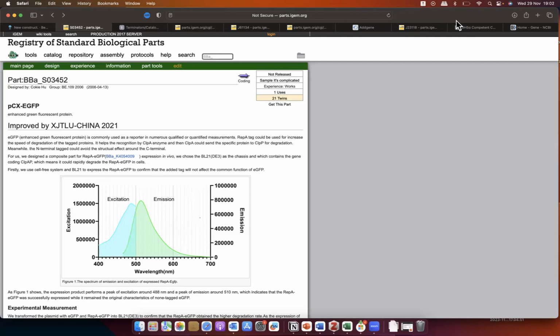So there are assemblies that are automated, and they are really based on this syntax, so you can directly do things without having to change them every time or purify everything, because once you create sticky ends that are personalized, the backbone can't reclose on itself.